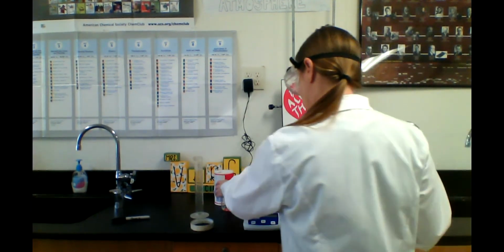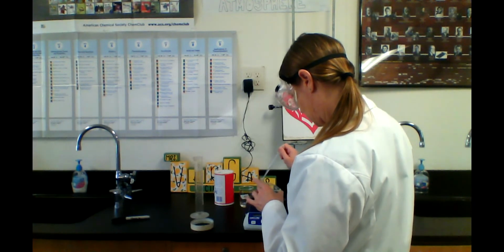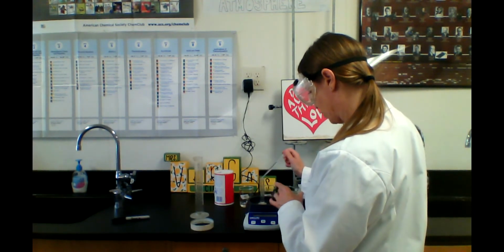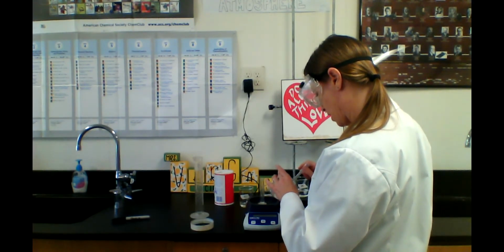Okay. And using my clean water pipette, I'm going to fill this up. And give it one more quick stir. Okay, so we're filling this with our water. Oh, it's not water, it's a solution. With our 5% solution of sodium chloride.